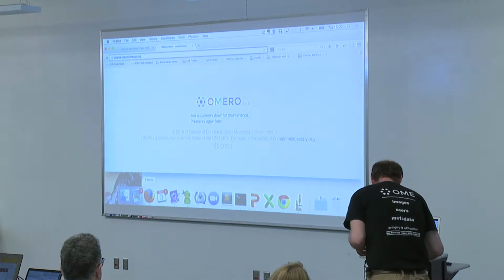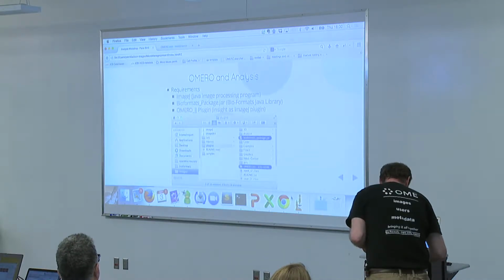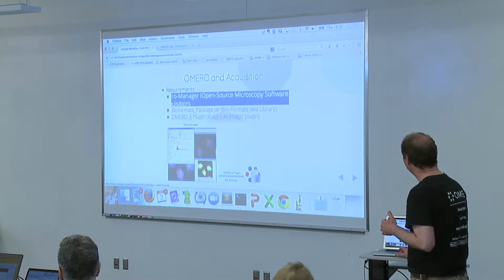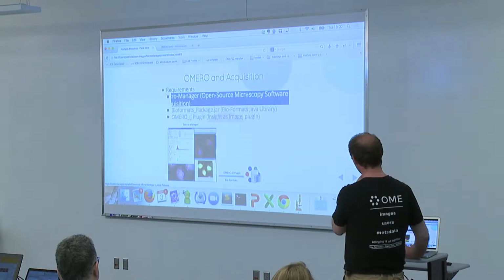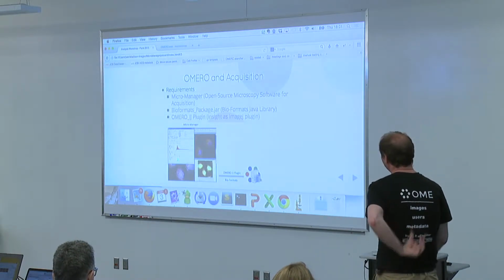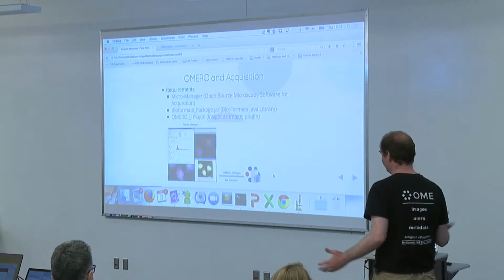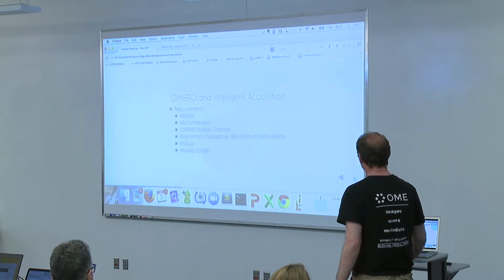I can show you just a couple of slides if I find them in this mess. This is basically the part I was showing to you, and we just went through that. These were the round trips with regions of interest. This is the OMERO acquisition. If you would like to go here, then you would have to be on the normal internet, so let's not click there. And this is basically storing the images into OMERO as you go using a simple plugin which he has written. And as the images are being shot, you can view them, let's say, in OMERO Web if you want to, in another location, so be it.